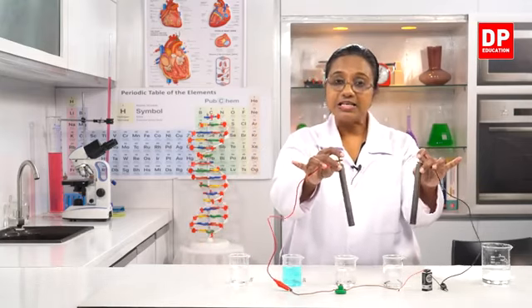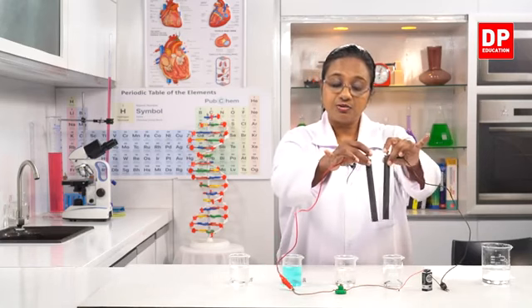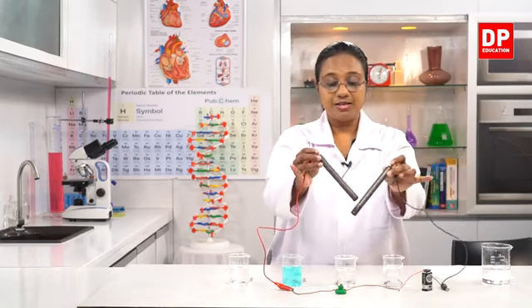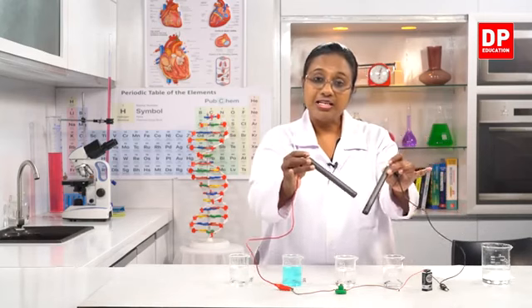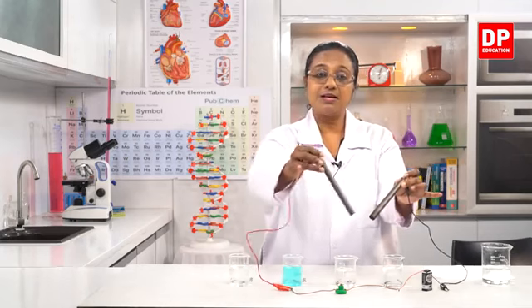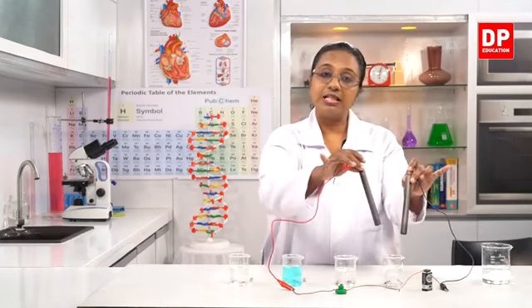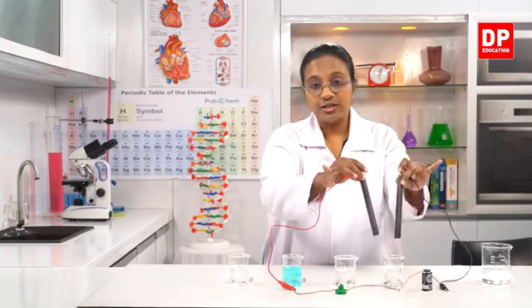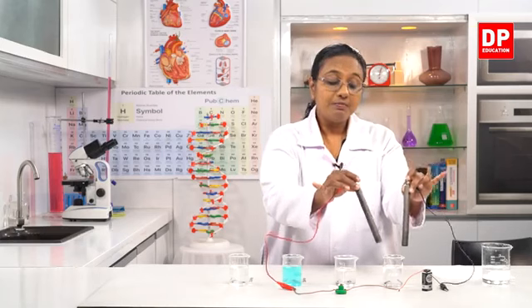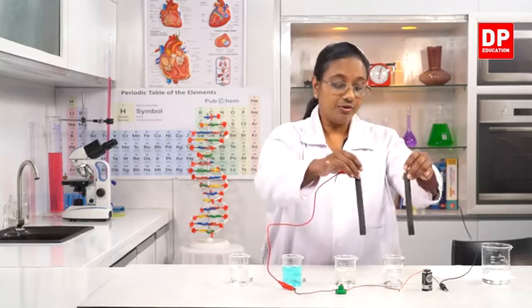When we insert the electrodes, you have to make sure that the electrodes don't touch like this, because if it touches, you can see the bulb will light. So in that case, it will be just a circuit with the electrodes only. So we have to make sure that the electrodes don't touch, and also the electrodes don't touch the wall of the beaker. So that is something that you have to remember.